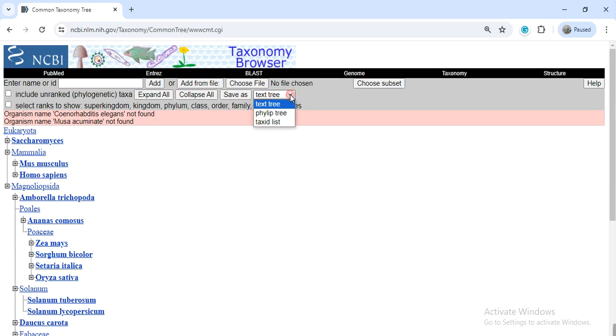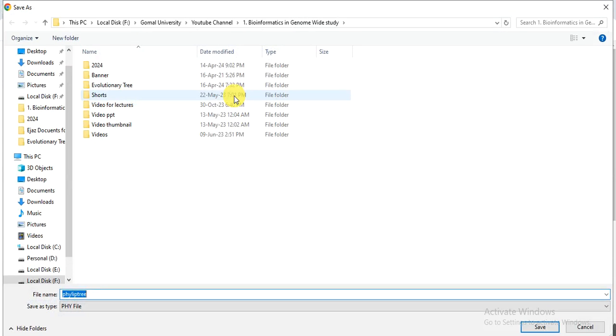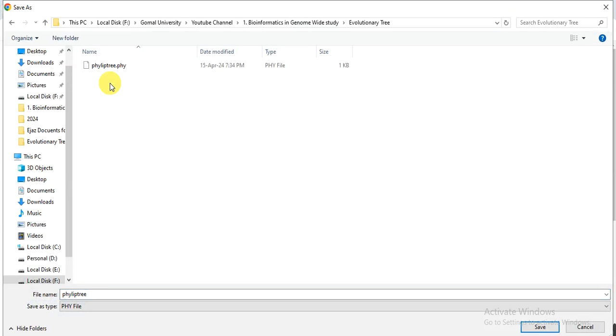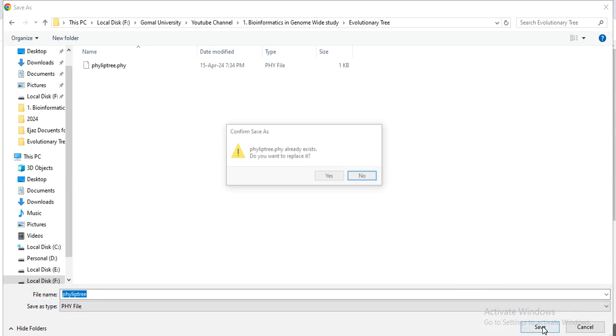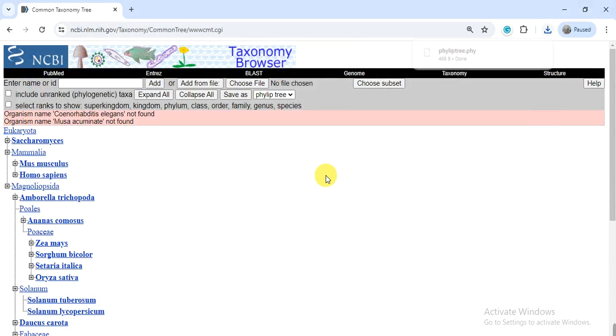So from here, there's a text tree. From here you can change it to file, Newick tree file. Click here and then click on save. When you click on save, it will automatically download into your computer or you can save it into the folder where you want to save it. So here I have saved my file.